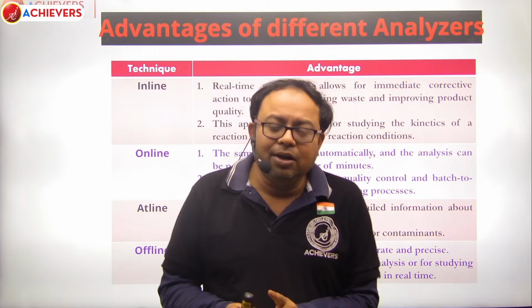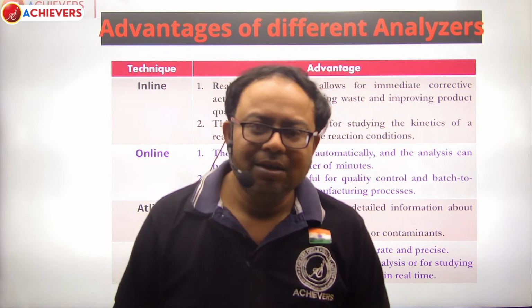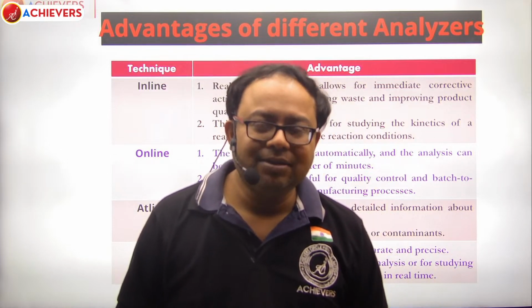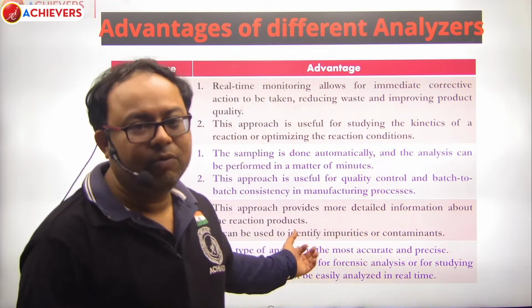Otherwise, you will not be able to crack the case. So that will be provided by offline analysis. That's what is important over here.